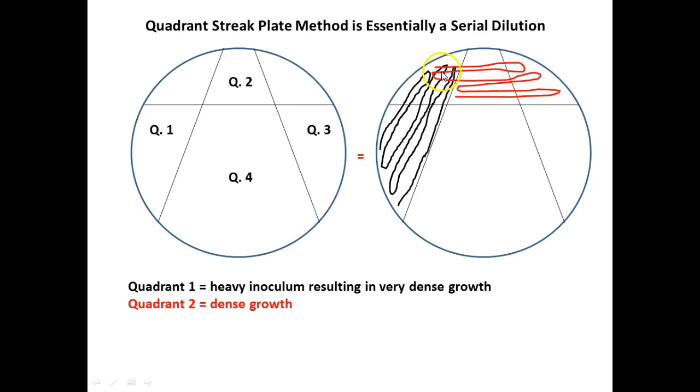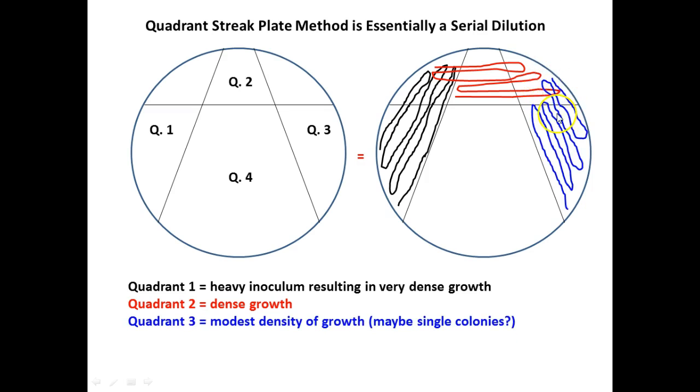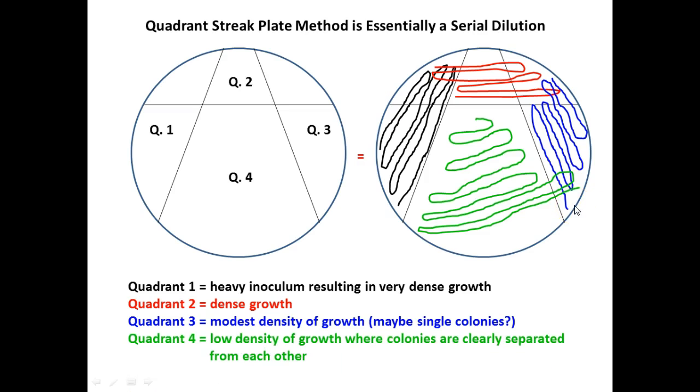Notice we're going to go and pick some up, right? And then we're going to spread them. And we're even going into the next quadrant so that we can then pick them up a few times to pick some up and then spread them out in this third quadrant. And then we're going to do it one more time into the fourth. That's one technique you could utilize.